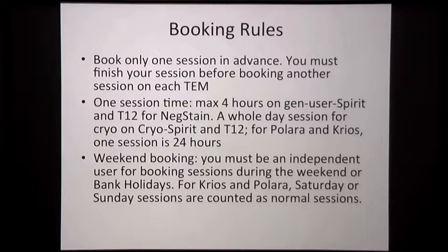So they all work. But for the Cryo-EM, we know the setup and pumping time, you need to take time. So when you change your grid, it takes 1 hour in this one. So we say you can book for a whole day. So the whole day will define how late you can stay, and getting ready for the cryo cycle for the next morning is okay.